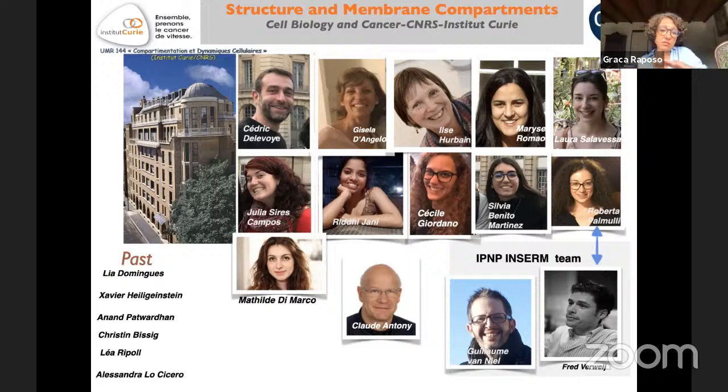But again, regarding the affinity of the antibodies, if they are good, after 15 minutes the antigens have been recognized by the antibody. So generally we incubate for about 30 minutes. But when you don't know, just fix with 2 different fixatives.